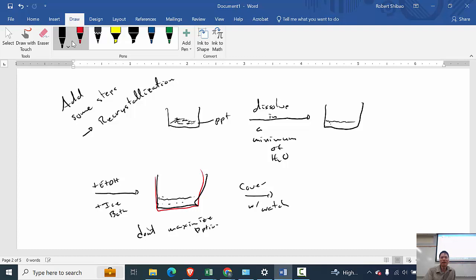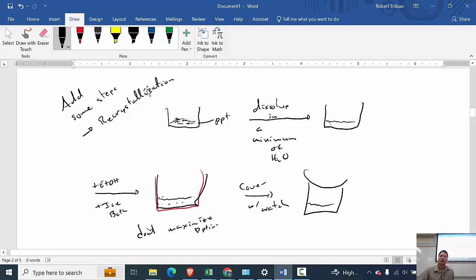So there are different ways we can do this, you know. But anyway, I'm going to cover with watch glass. And leave it in your drawer.